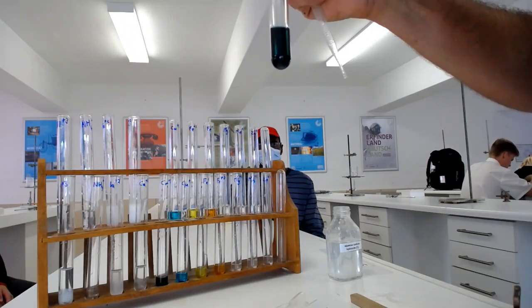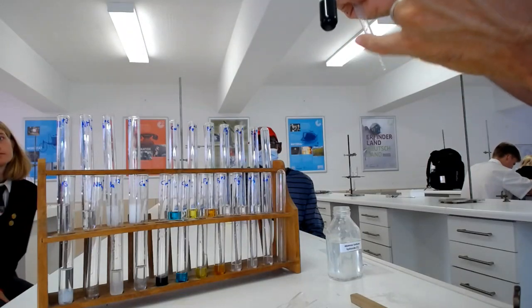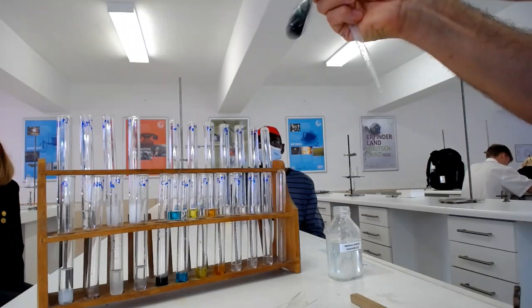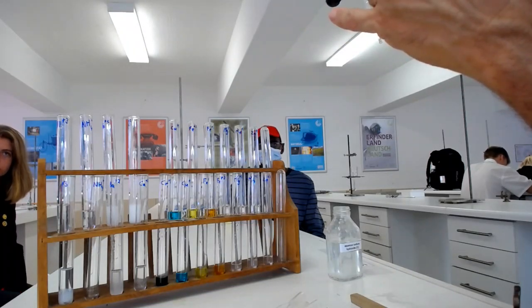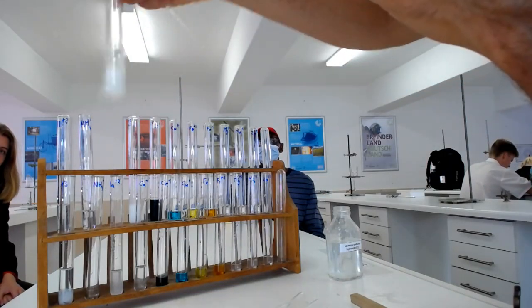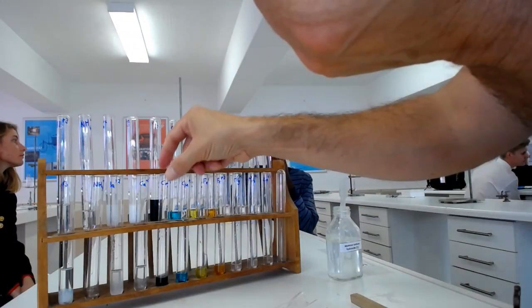And this is the type of observation that you need to do. So Andrea, when giving your observations, it is important to know: is this a liquid or is there precipitate? Precipitate would be things dropping down and lying on the side if you let it stand for a moment, or there would be white granules. Look at this. This is a precipitate. To the side, you can see there are some granules.